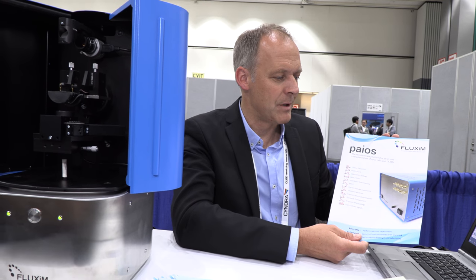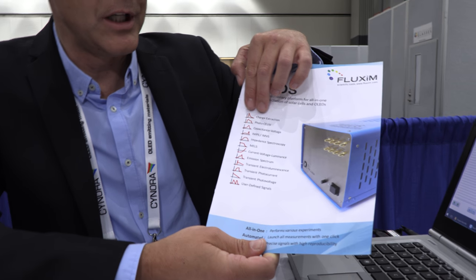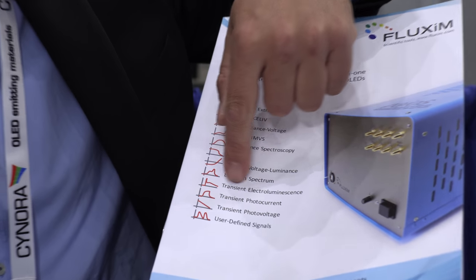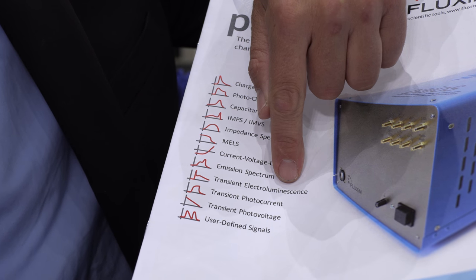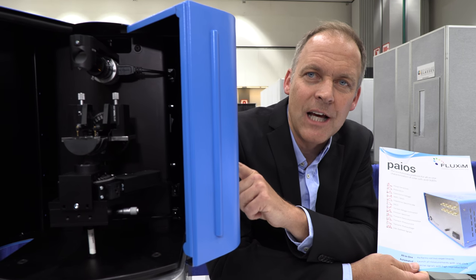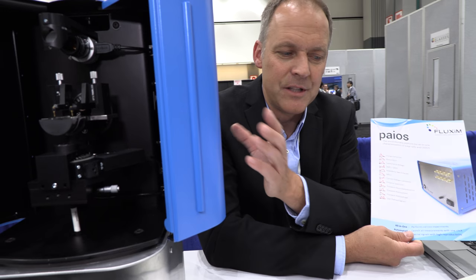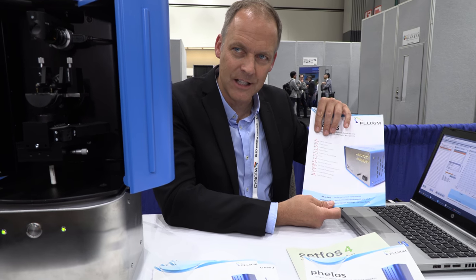What's the main difference between that and this? The main difference? This is focused on electrical properties of OLEDs where we only look at, for instance, transient electroluminescence measures only the time-dependent light output and here we have angular resolution of the light coming out. We get the spectrum of light, angular dependence, so it's complementary. This is more optical analysis and this is more electrical analysis.